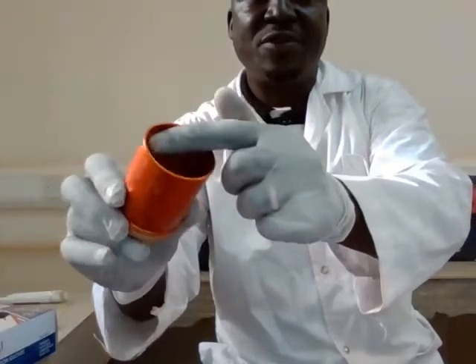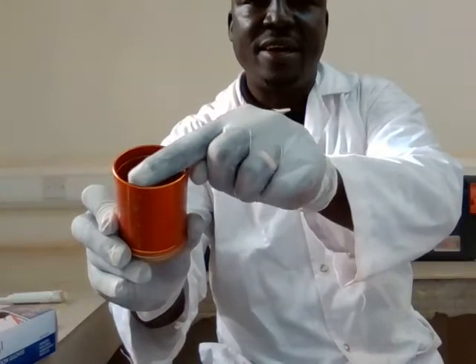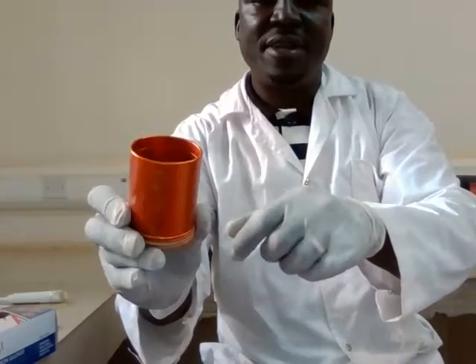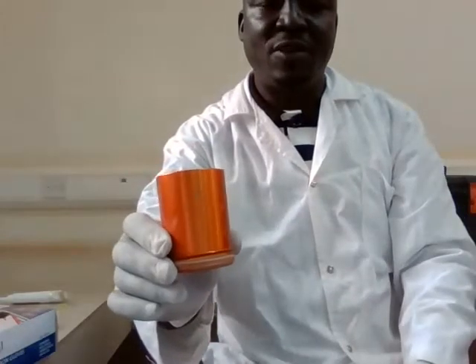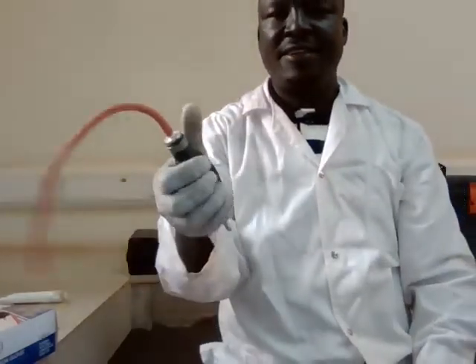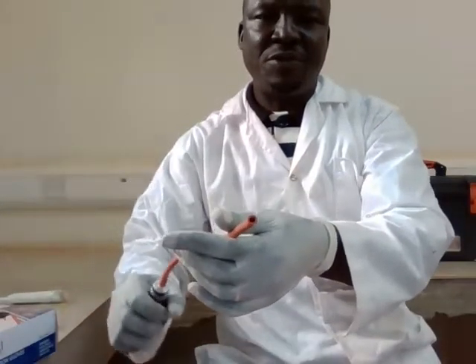Then this other last ring here is 100 milliliters of water sample. This is a membrane filtration unit, and this is the suction pump, which is the hand pump that will help you to reduce pressure that will suck the sample fluid.